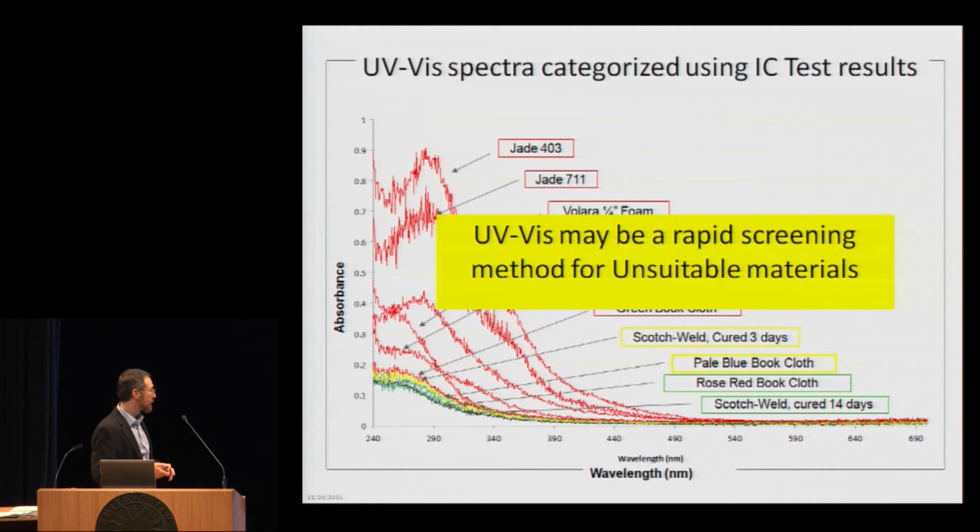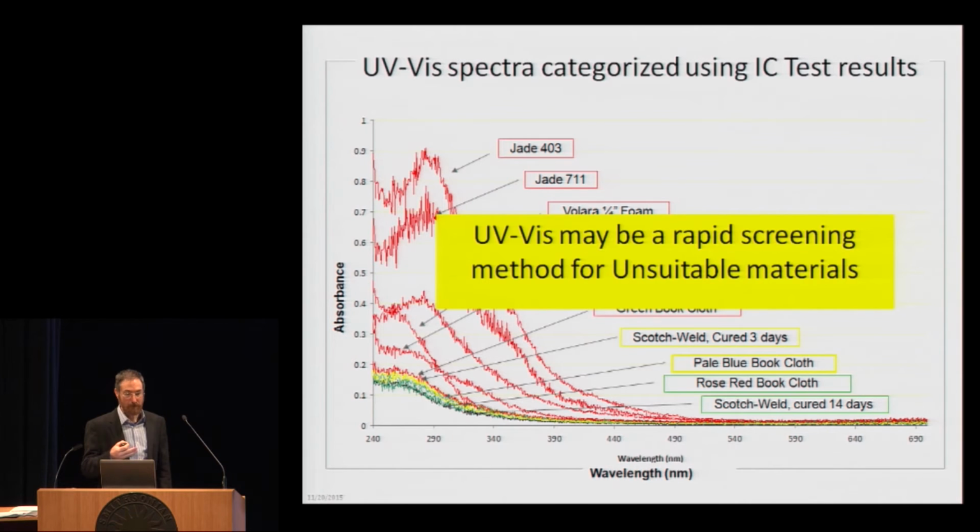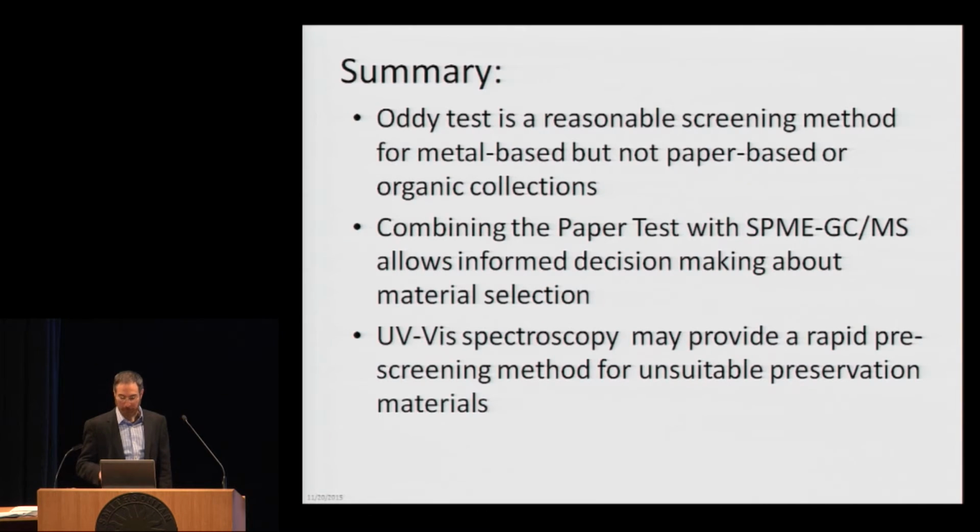Do I need to do more of these? Yes, I'd like to get hundreds of materials onto this chart so that we can really say whether we've got a good correlation or not, or how consistent this type of degradation is. And that is something I'm setting up at the Met along with a system that's very similar to Chris's and the IC test. So in summary, I have 3 main points.